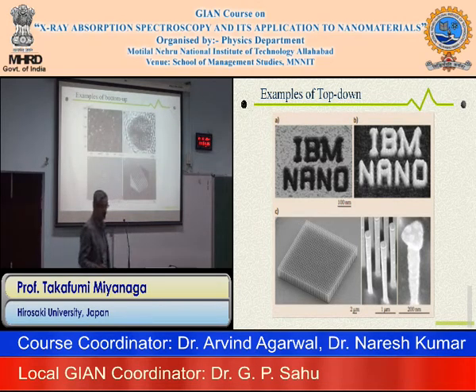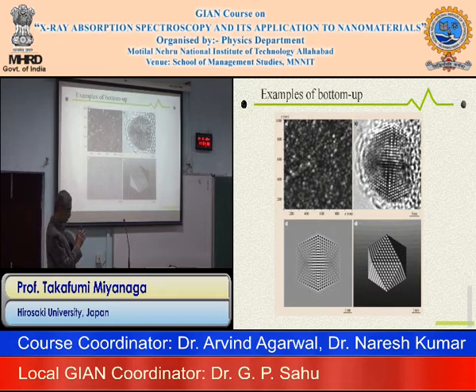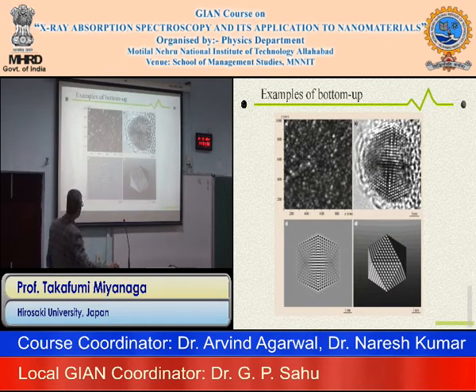Another is the bottom-up system. In the bottom-up system, the crystalline is generated automatically. That is the photo, and here is the transmission electron microscopy. Here are just models. The model is constructed for these photos.